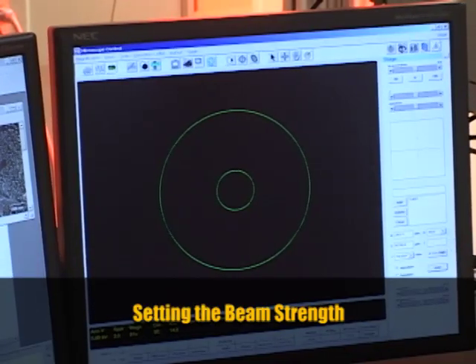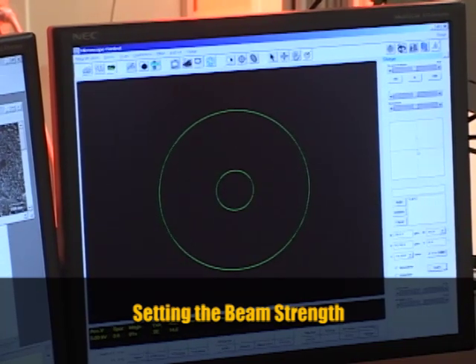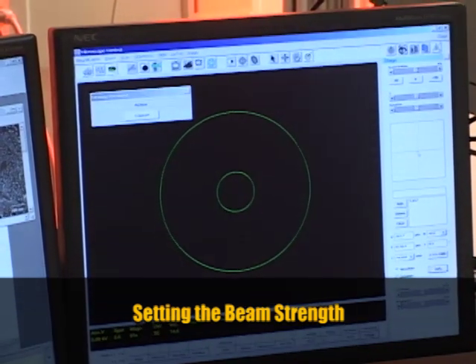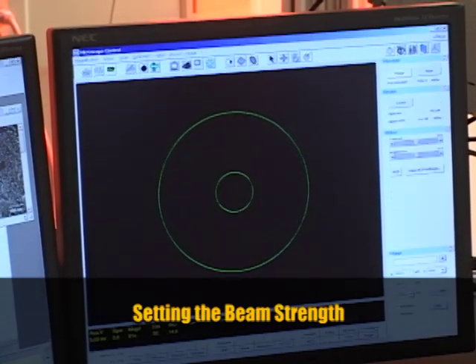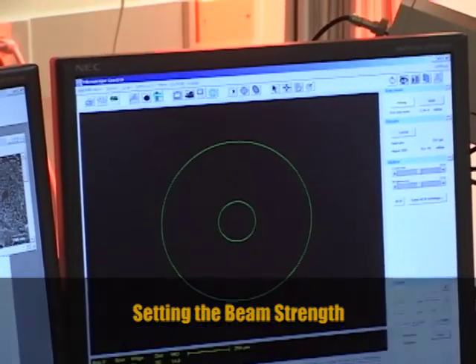While the chamber is pumping down, you can do two things. The first is you want to center the sample on the stage. And the second thing you want to do is set the beam conditions that you're going to use to image the sample.